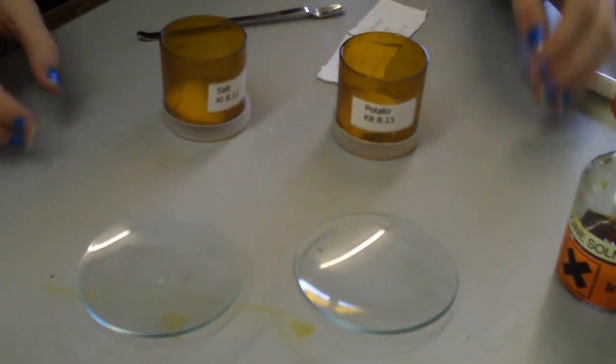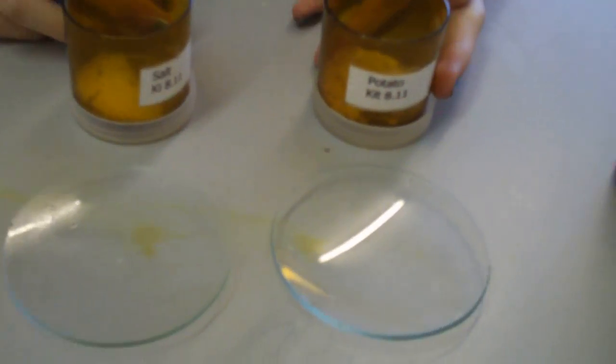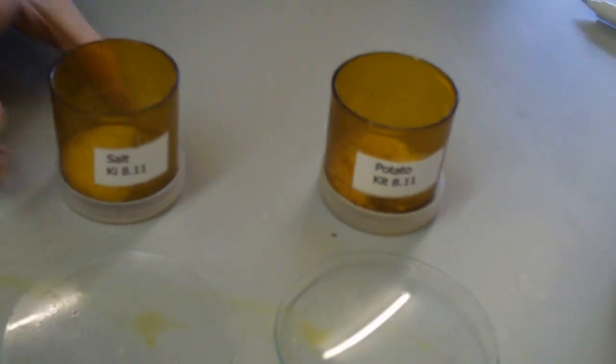The apparatus underneath is two watch glasses, two tubs of food, which are potato and salt, and iodine solution.